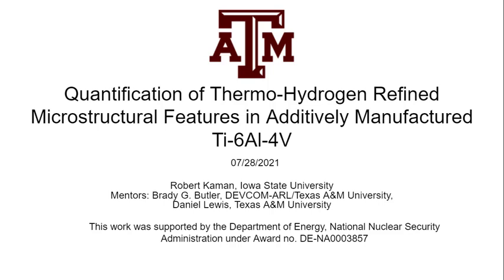Hi, my name is Robert Kaman, and my project is the quantification of thermohydrogen refined microstructural features in additively manufactured Ti-6-4.